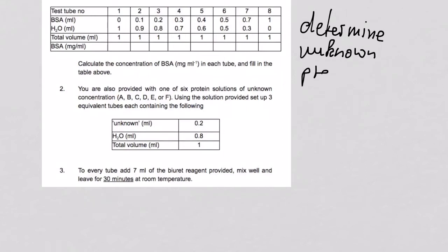Unknown protein concentration. Using a spectrophotometer.